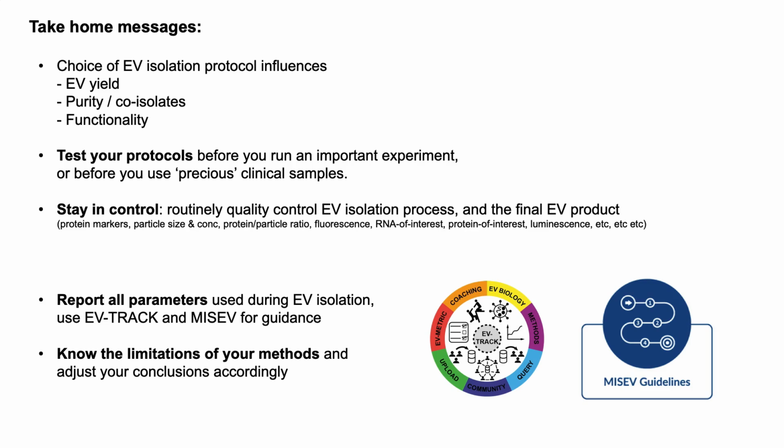And of course, it's important to report all your parameters, be transparent in your reporting using the EV-TRACK and MISEV guidelines, and to be aware of the limitations of your methods and adjust your conclusions accordingly.